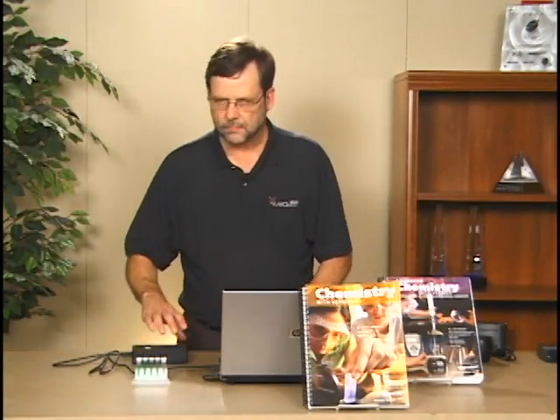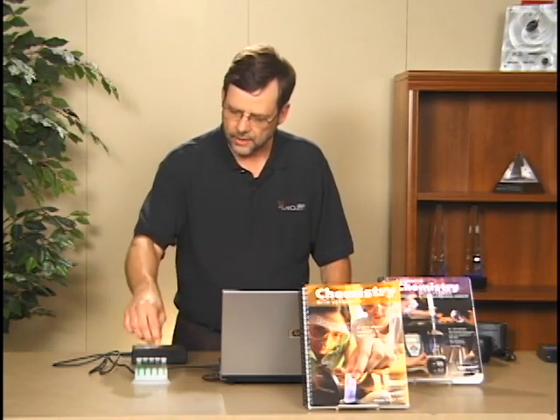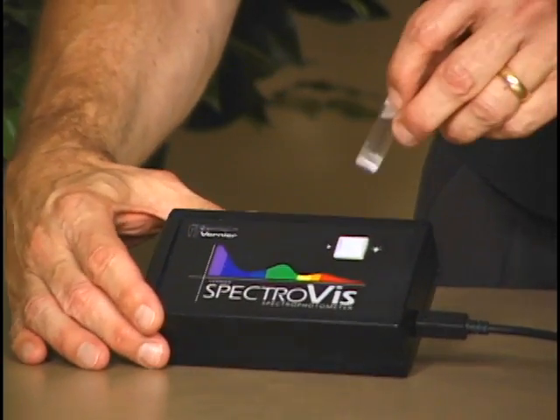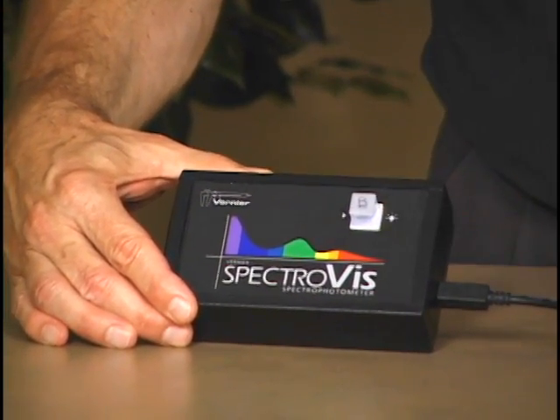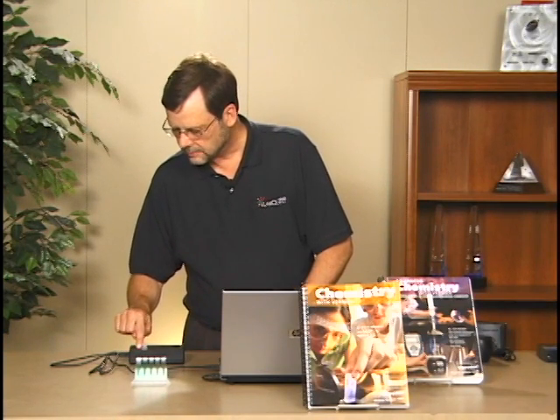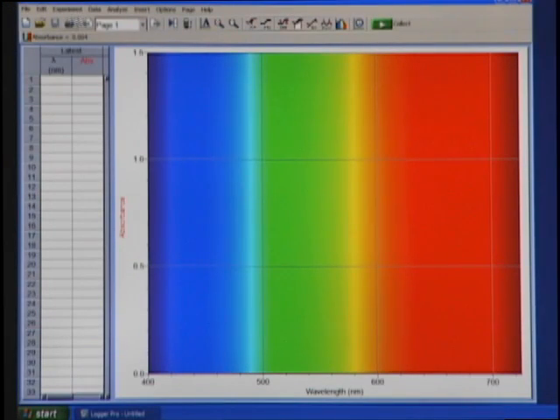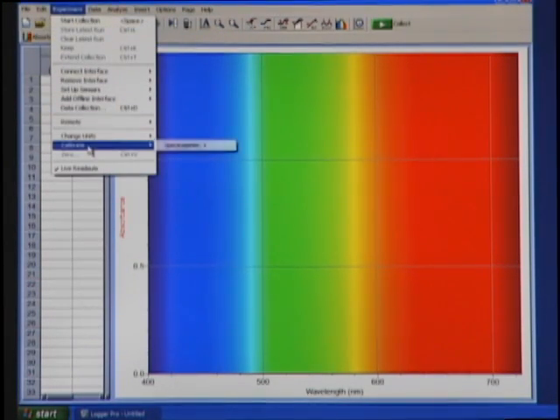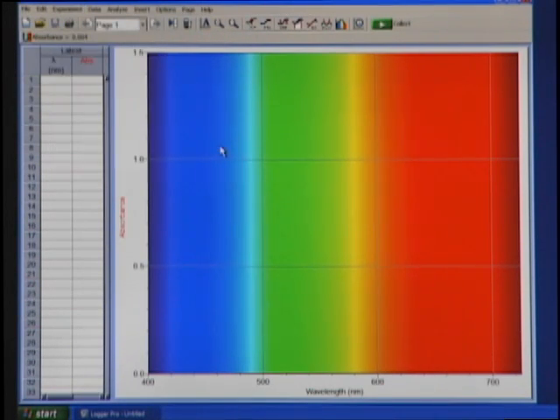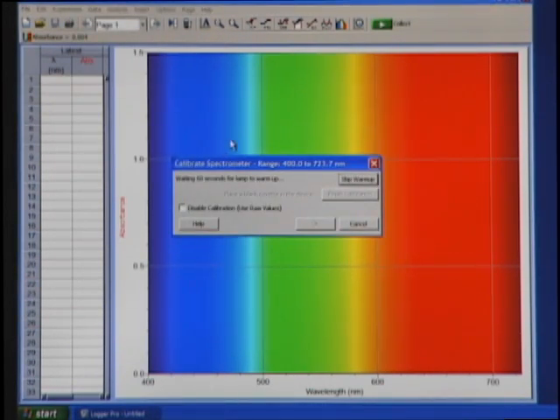So my first step here, as with most spectrophotometers, is I want to do a calibration. I'm going to take a blank cuvette and place it into the cuvette slot of the spectrometer. The lamp is over on this side of the cuvette slot, and the detector array is over on this side, and so I've aligned that correctly. Now I go into Logger Pro, and I'm going to choose from the Experiment menu, Calibrate Spectrometer. In the dialog, it says that it's going to wait 60 seconds for the lamp to warm up. Now we're just about done. The warm-up is just about complete.